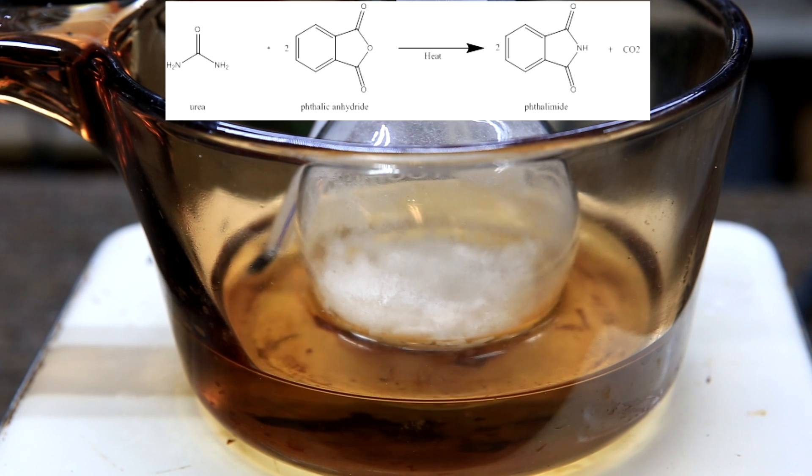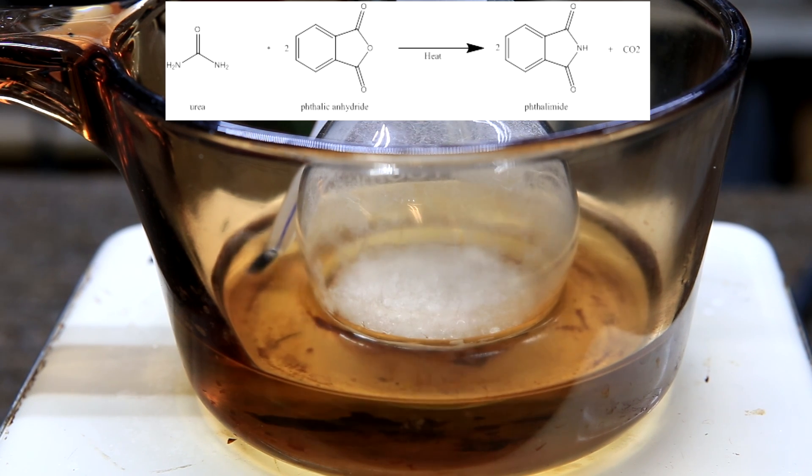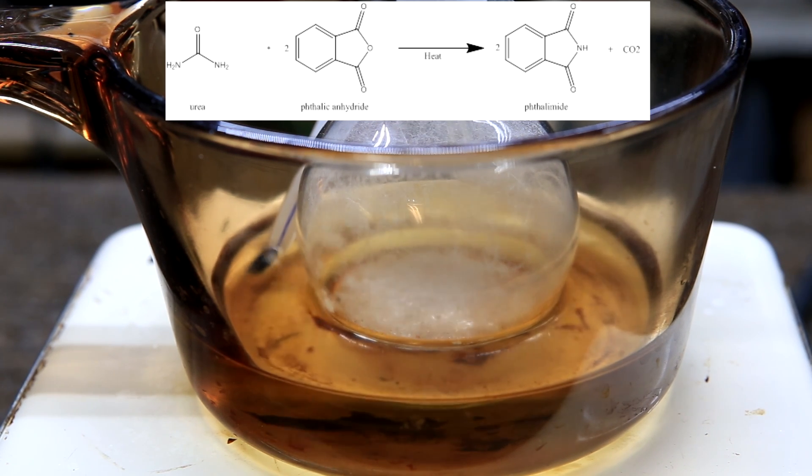The overall reaction that is occurring is shown above. In the solid state not much reacting occurs, but once we reach the melting point of urea which is around 135 degrees Celsius, that's when the reaction starts taking place. First the urea reacts with the phthalic anhydride to form phthalimide, CO2, and ammonia. The ammonia that's produced is able to react with another molecule of phthalic anhydride and form another molecule of phthalimide.